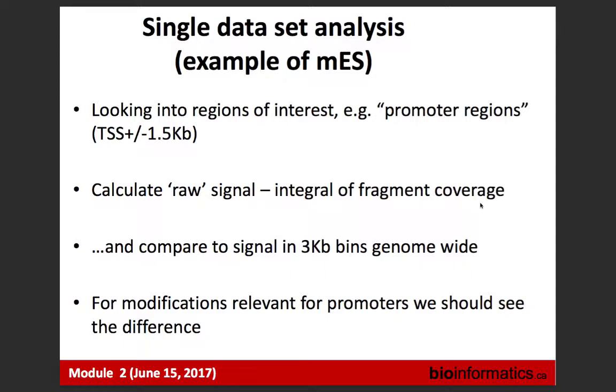And of course, how to define promoters, that's a question. Here we define it as a region, TSS plus minus 1.5 kb. And we only take the major transcripts. We are not talking about alternative promoters. Then what we're going to do is compare the signal. We calculate the coverage of the signal in those promoters to 3 kb regions genome-wide. It's clear what we are going to do.